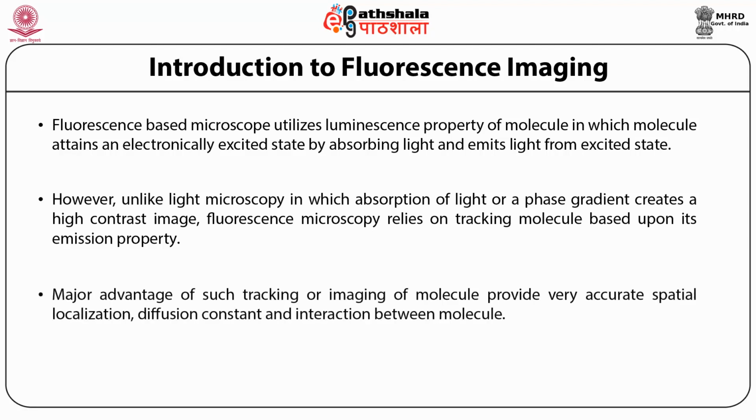One of the major advantages of this technique is that it is used not only to get the spatial localization of the sample, but also to tell whether the molecule we are looking at is diffusing at a specific rate or not. We can also figure out the interaction between two different molecules, whether they are interacting or not.